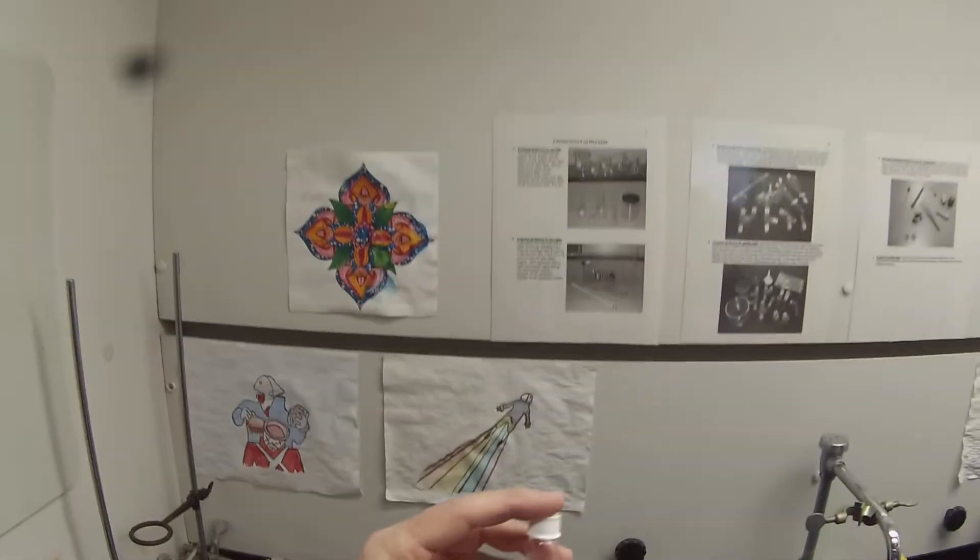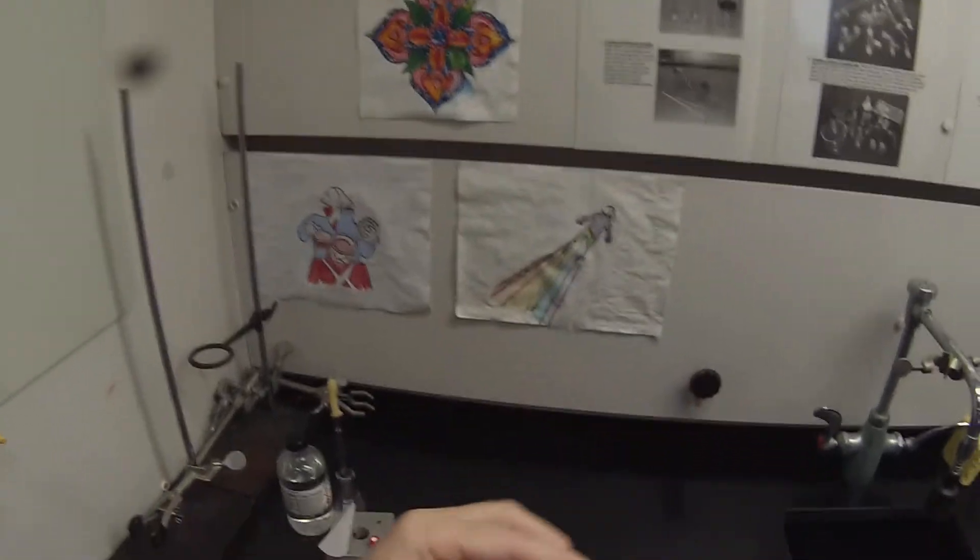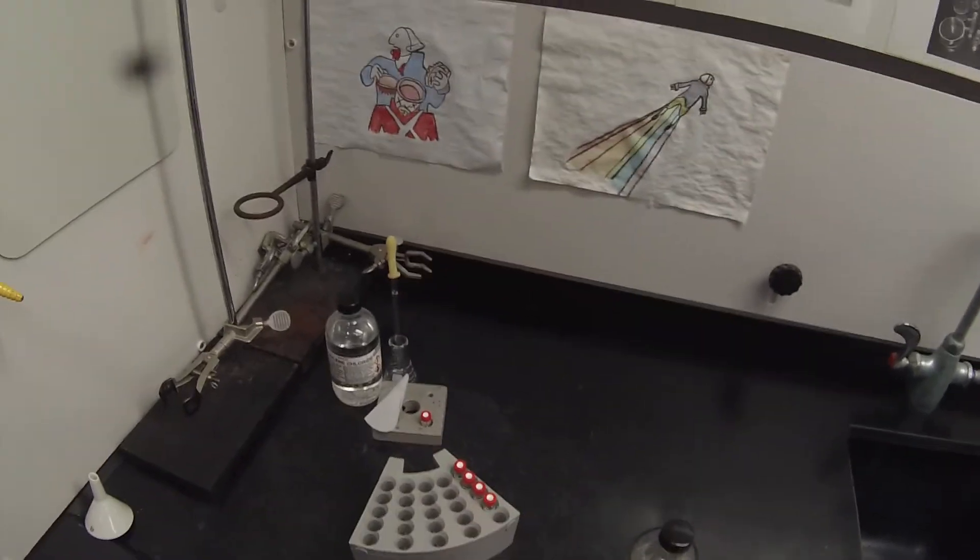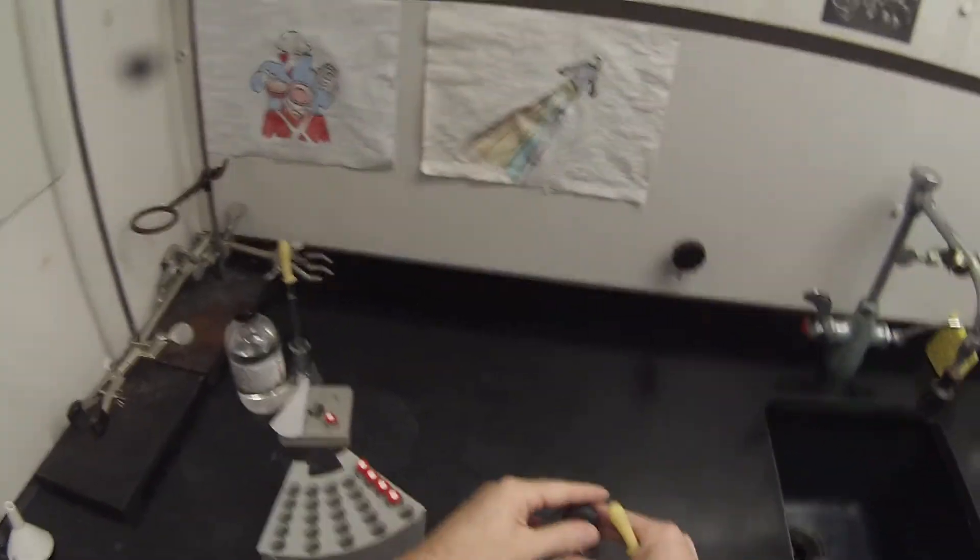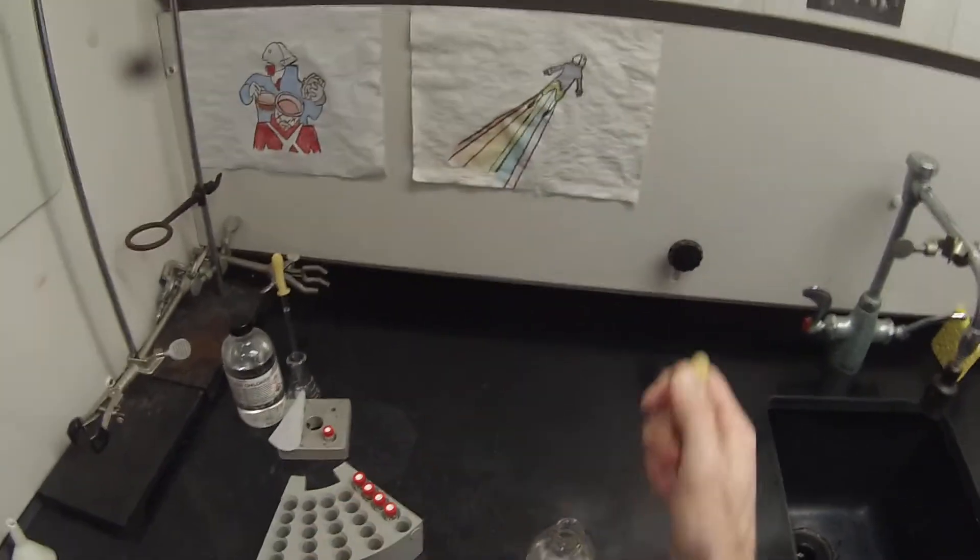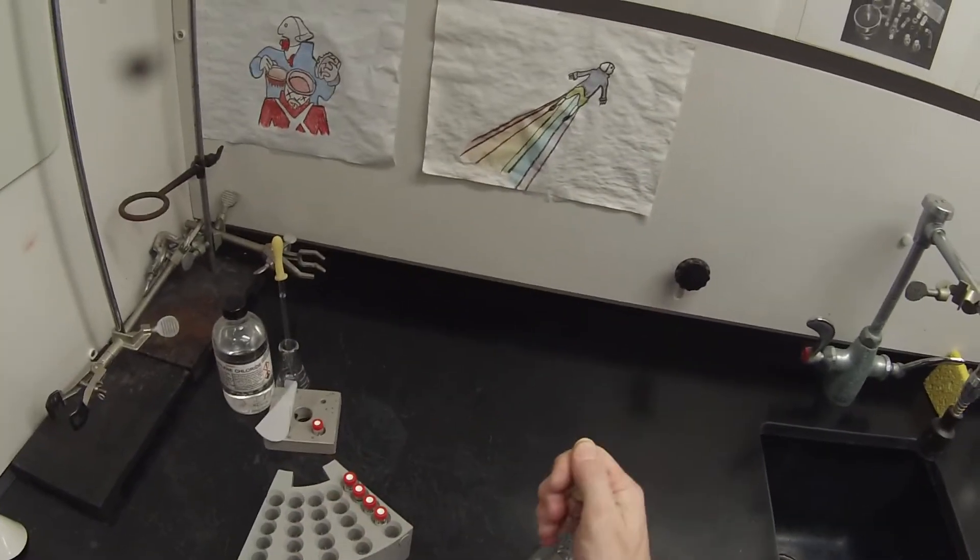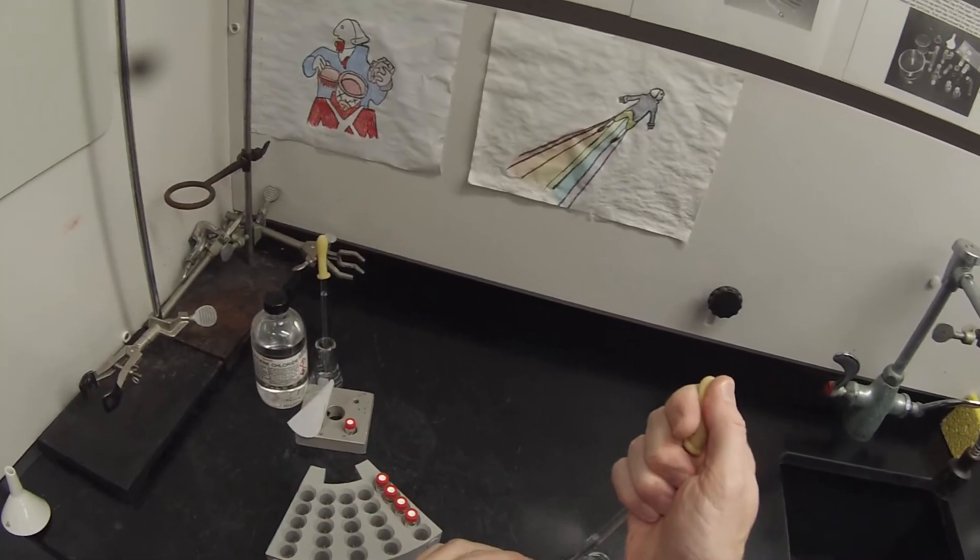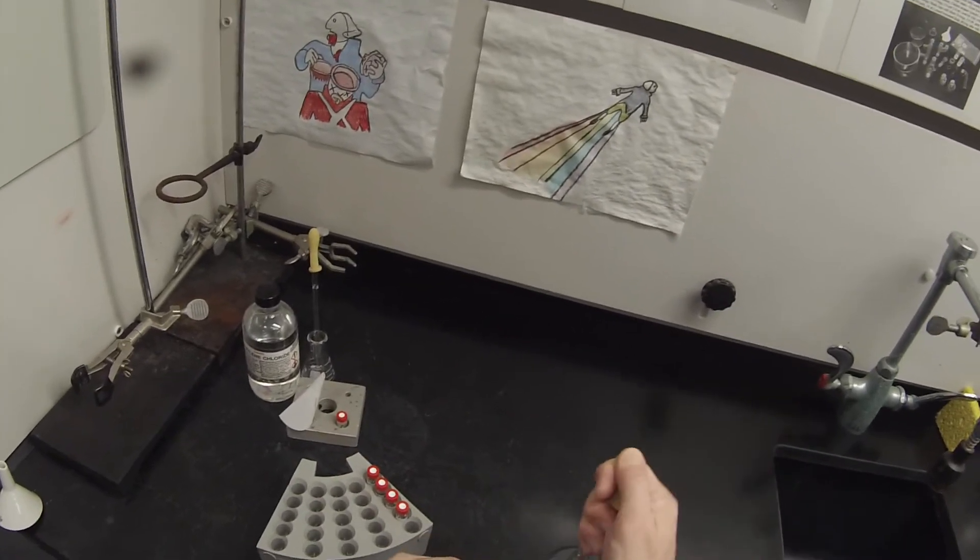And I also need to fill the wash bottle for methanol so that the syringe can be rinsed with methanol in between each analysis.